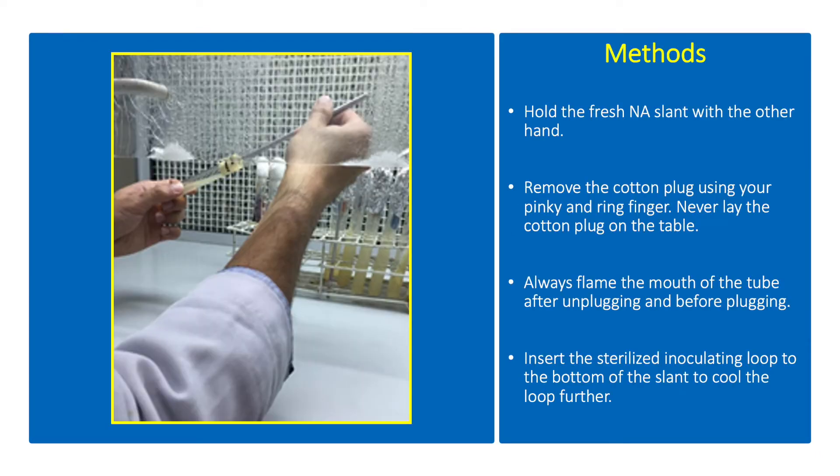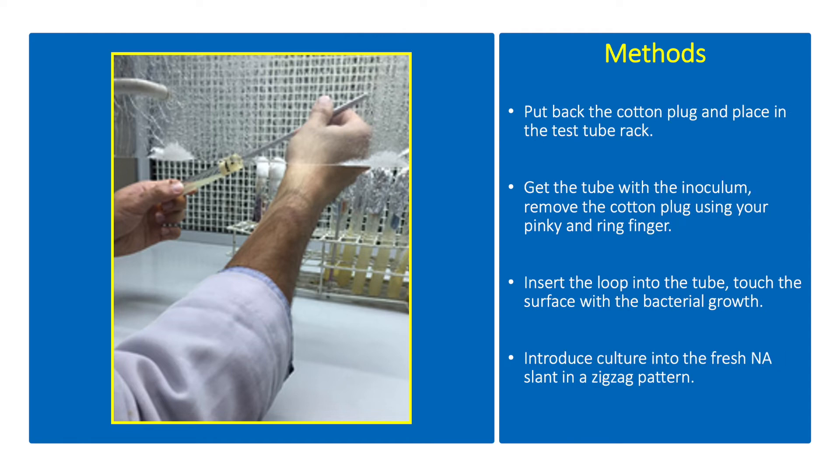Hold the fresh NA slant with the other hand. Remove the cotton plug using your pinky and ring finger. Never lay the cotton plug on the table. Always flame the mouth of the tube after unplugging and before plugging. Insert the sterilized inoculating loop to the bottom of the slant to cool the loop further. Return the cotton plug and place in the test tube rack.